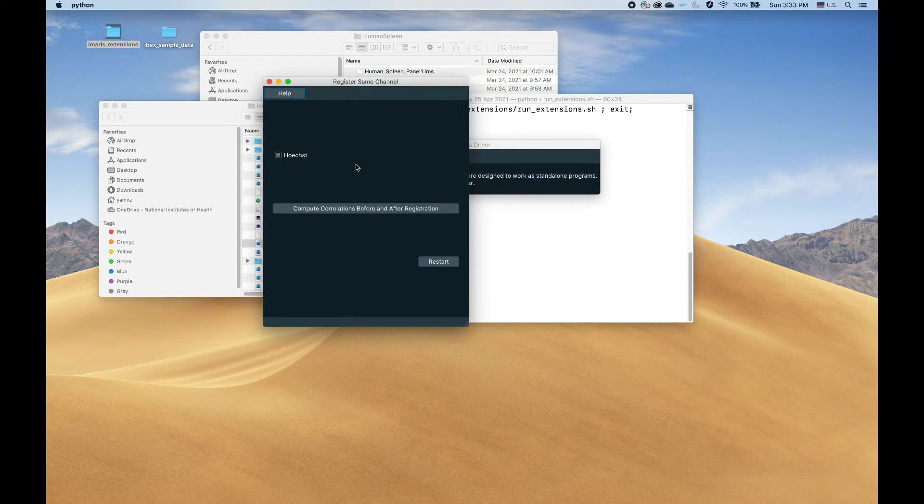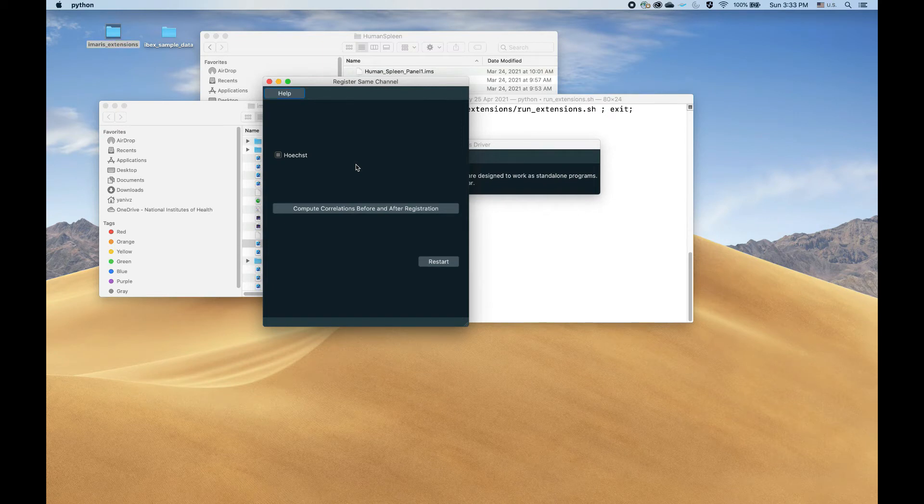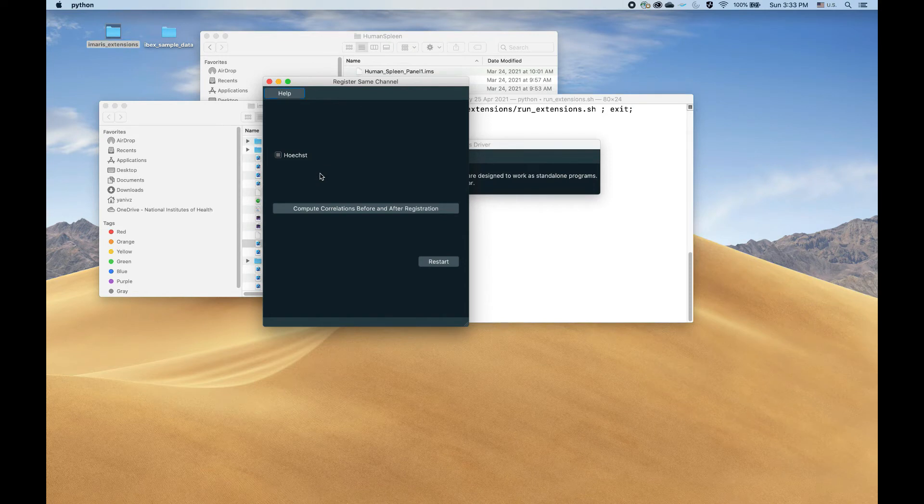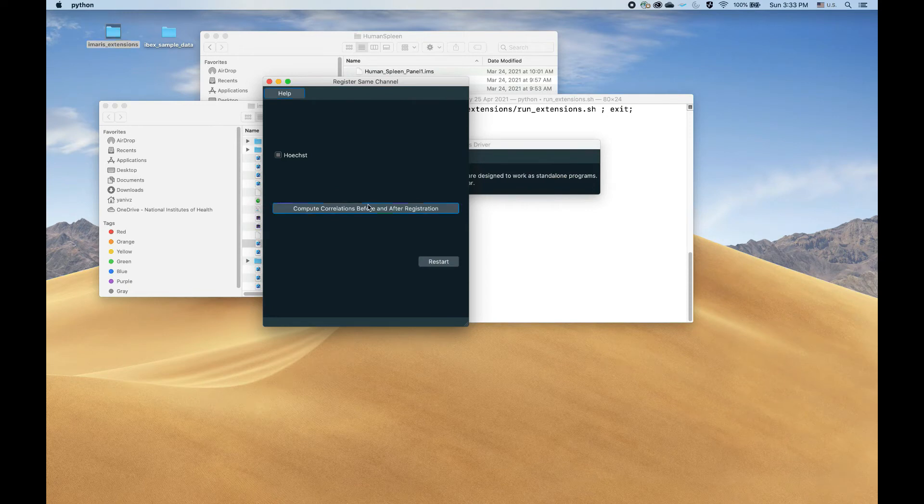This is really optional. It will save the correlations between the Hoechst channel in this case, but any common channel across all the panels, and it will save the correlation before registration and after registration between the different panels.